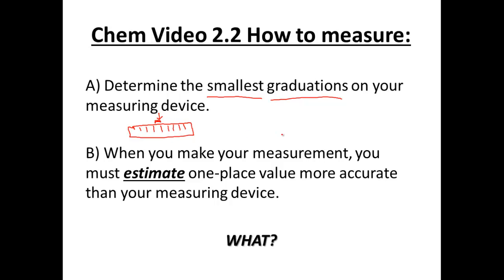Or if we were to look at, say, a graduated cylinder, how much volume is measured in between each of the markings. We call those markings the graduations.